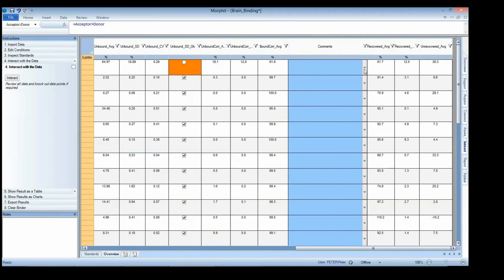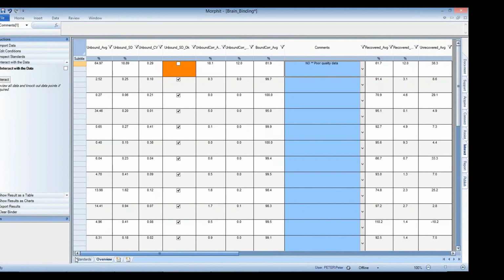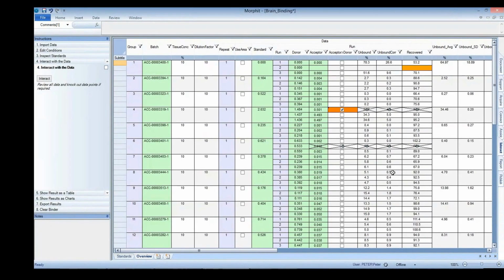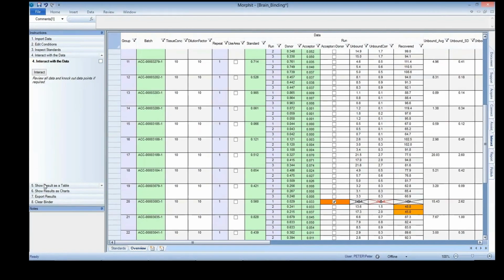And then there is a comments box, and we have pre-populated it for you. So these are the typical things you would like to comment. These are all pre-filled from other tables, and we can just take your preferences and stick them in there. And on top of that, you've got your recovered fractions and all that. So it's pretty much to look at, but you are in total control. This is exactly showing you the type of control that you want to have on an individual replicate level.